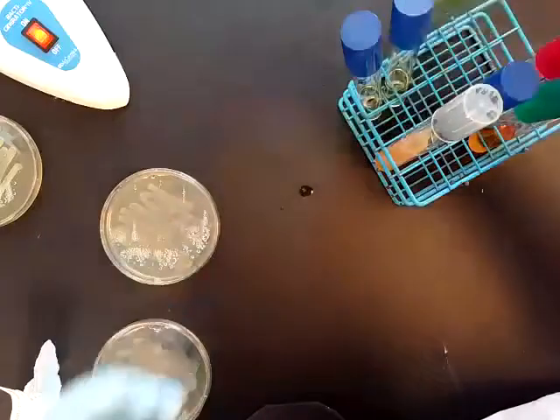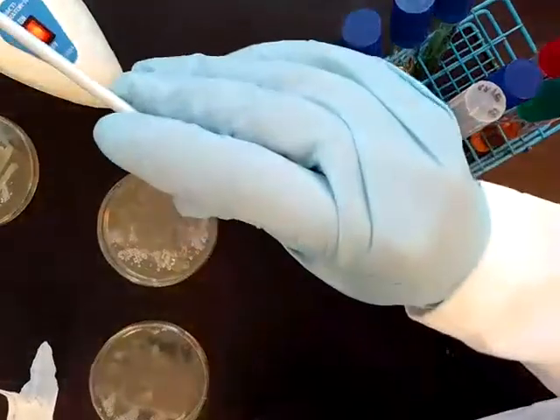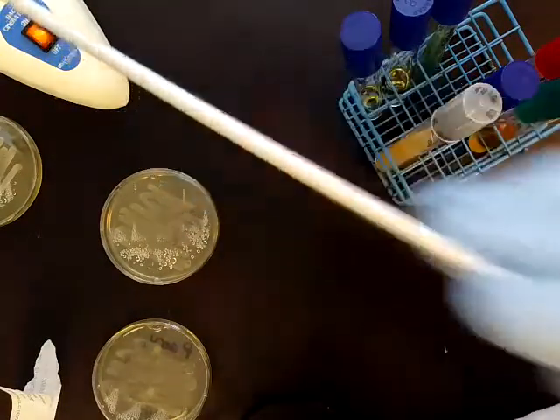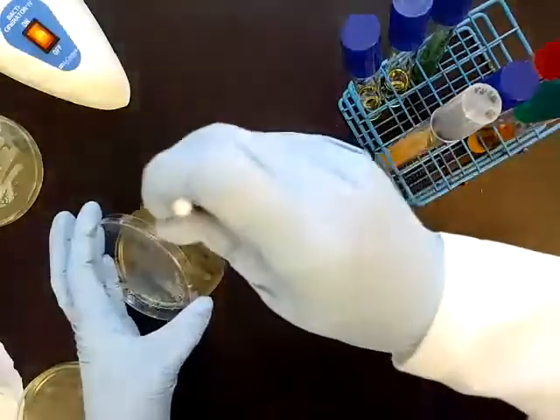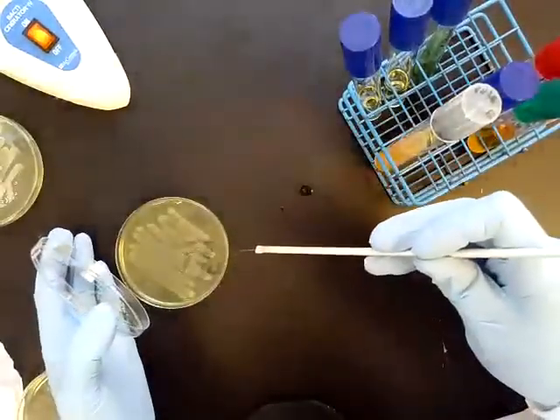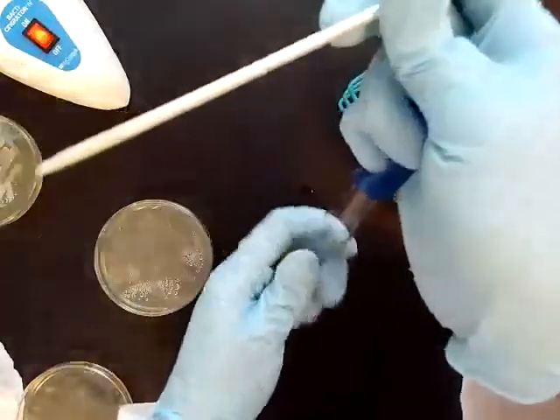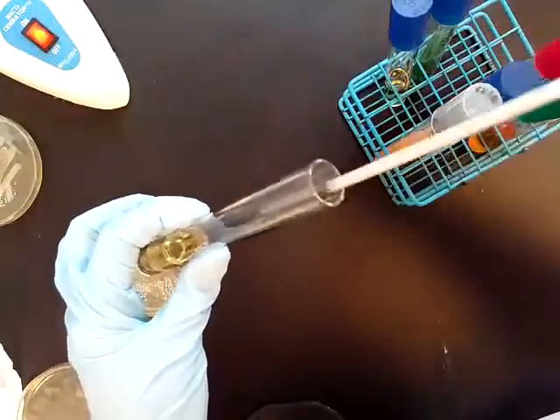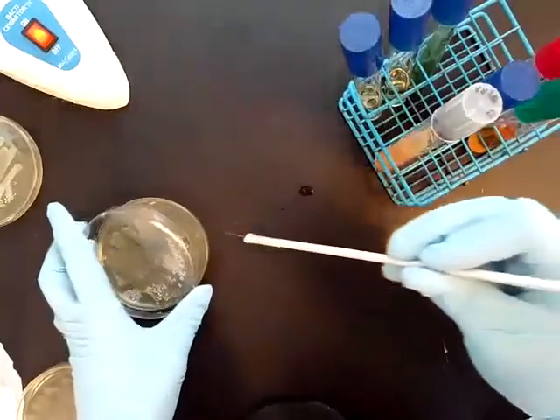It's green in color initially. So we're going to transfer bacteria to this media. And we're going to use E. coli to inoculate all of these. So grab some bacteria, aseptically transfer it. And we're just going to continue inoculating.